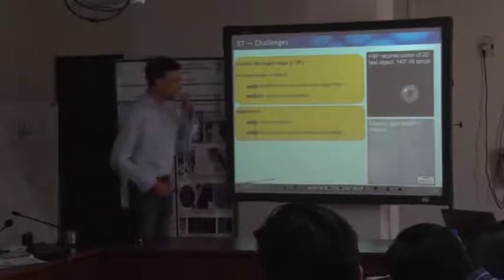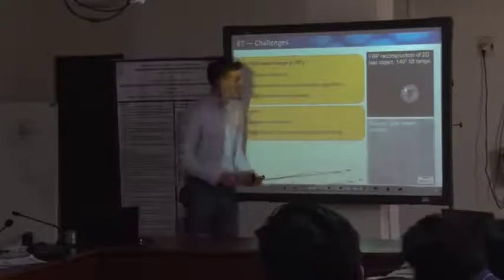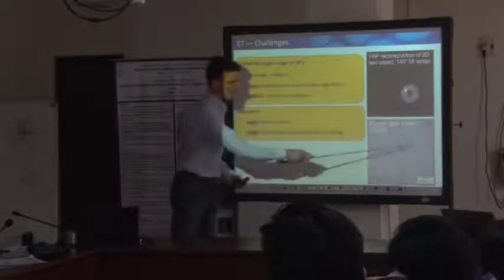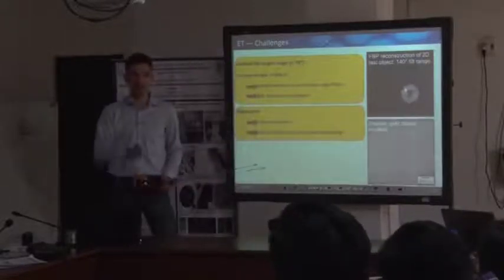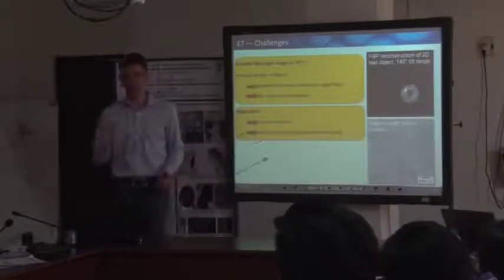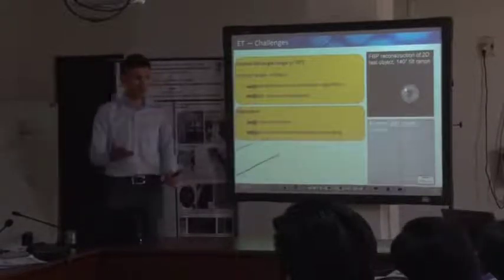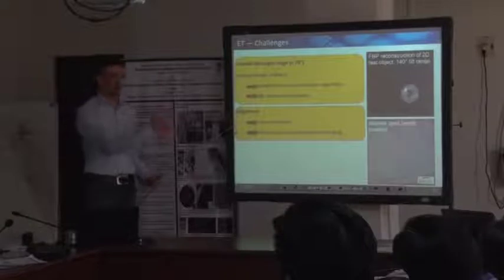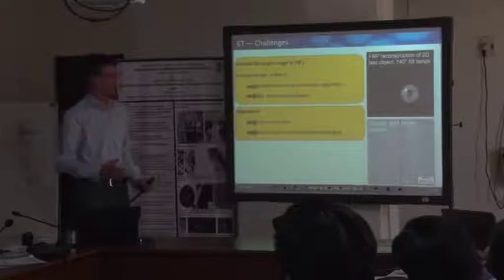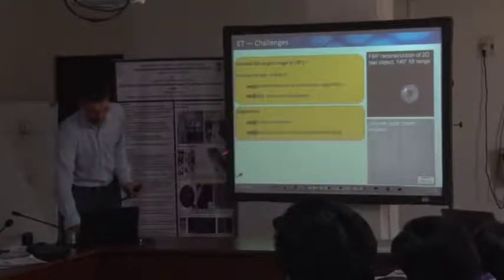This is after the whole alignment. In this particular case, what Benjamin did is use software available to just cloak those beads. So we just remove this intensity that is introduced by assigning some average intensity from adjacent regions. So this is what you might do, but this is not the perfect way. But in principle, otherwise you might end up with a strong contrast from these gold beads. And depending on your feature size, it might not be needed.